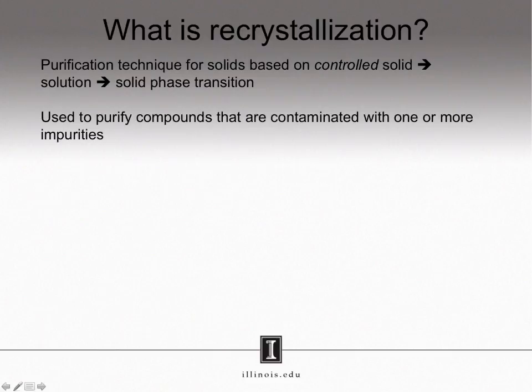This technique is capable of purifying compounds that contain one or more impurities. The physical property that is exploited in this process is solubility.